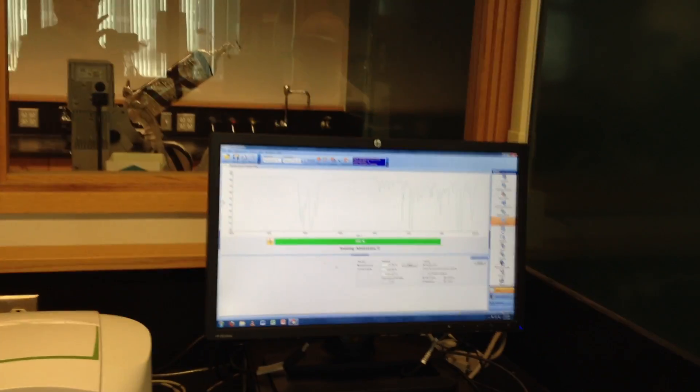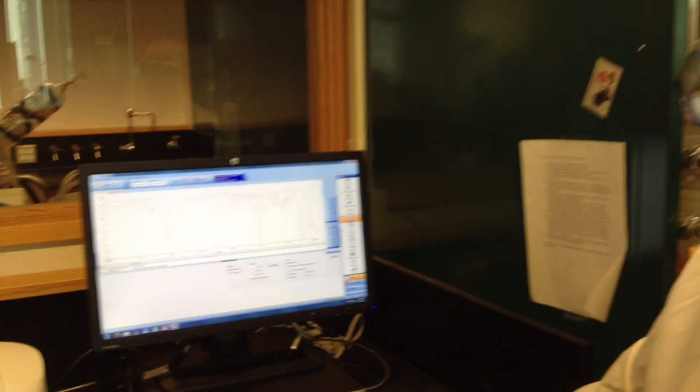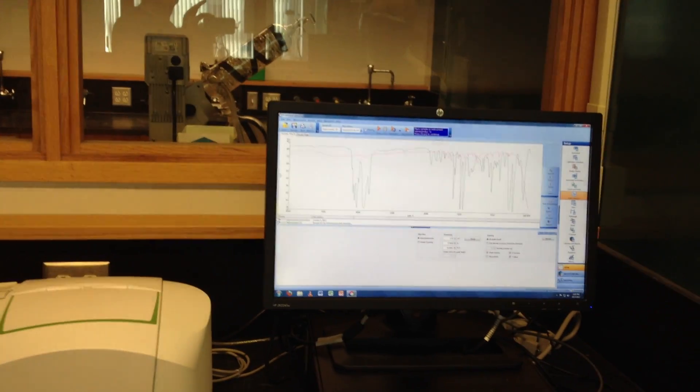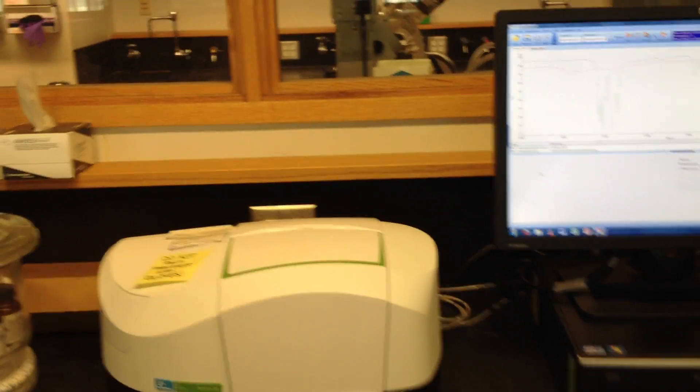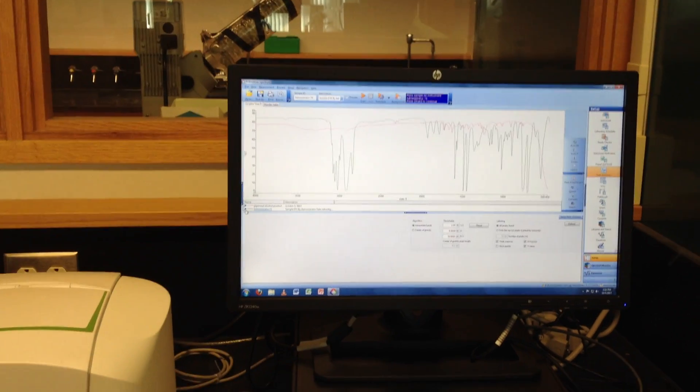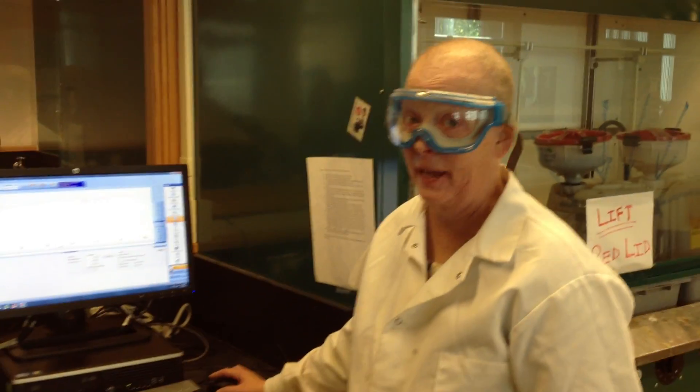So there's a very strong-looking spectrum. Can you see that? You can see my pink spectrum superimposed on that spectrum. So as students run, the spectra just sort of pile up. Now, I don't want this spectrum. I want the pink one. This is a standard. It looks gorgeous. It's an absolutely gorgeous-looking spectrum, very strong. I want to get rid of that. If I want to get rid of it, I didn't even name it. But if I want to get rid of it, it's Administrator 72, or it's just the green spectrum. It gives each one a different color. It's kind of cool for students, because when students are running similar samples, they can tell if their sample kind of stacks up to the prior sample. So I hit Administrator 72, because I want to get rid of it. It says Remove Curve, and then I just removed the curve. So I got rid of it, because I don't want it. But I just want you to know you can do that. That's why it's really good to label your spectrum.